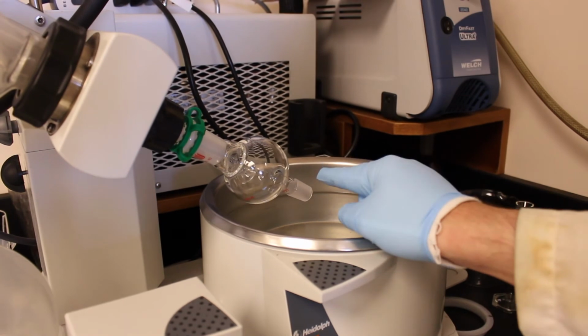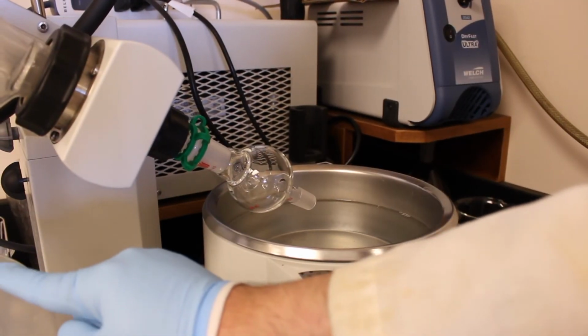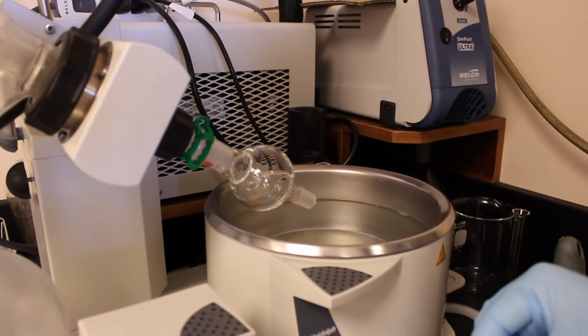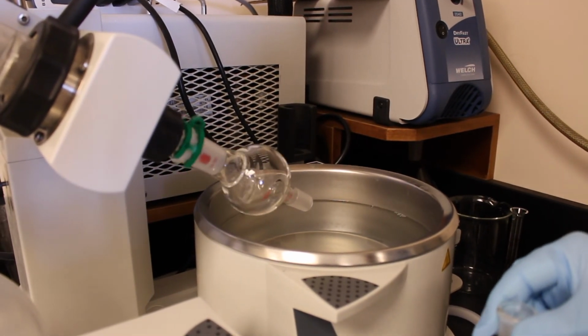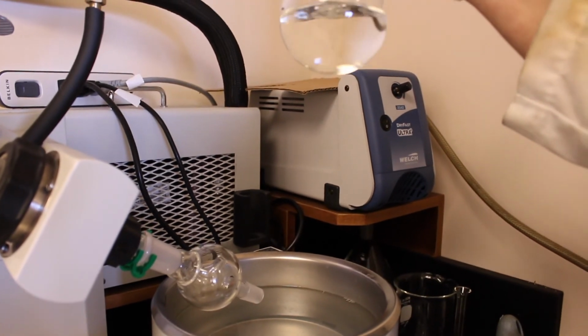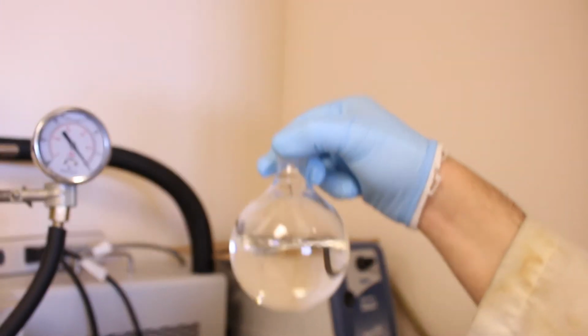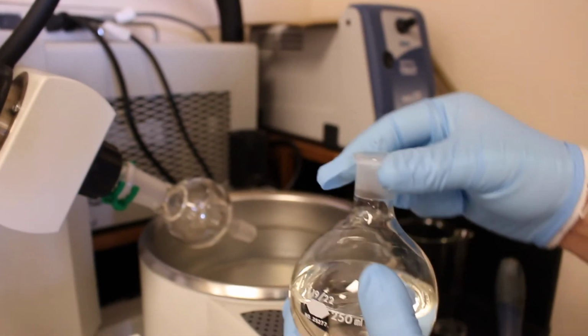Oops, maybe too much, but it's designed to not allow the liquid to jump into the solvent trap, which would contaminate it. So to prevent bumping, the first thing is you rotate it, so that helps mix the solvent evenly so it evaporates smoothly. But the other technique is to fill the flask no more than halfway full. As you can see, this is fairly full, so there might be an increased risk of bumping, but that's okay. As I said, some people just like to live dangerously, and I am one of those persons.